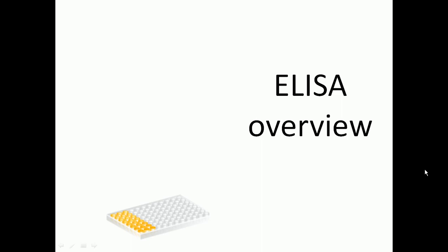Okay. So it's an assay, a technique that's called ELISA assay or ELISA technique, whatever you say. It contains a particular type of glassware set like this one, as you can see here. This is called the microtiter plate. This microtiter plate is nothing but a plate containing small wells. Microtiter plates are available in different types. Some of them contain 96 wells, some of them even more wells. Usually they contain 96 wells, so 96 small wells are present all around this.